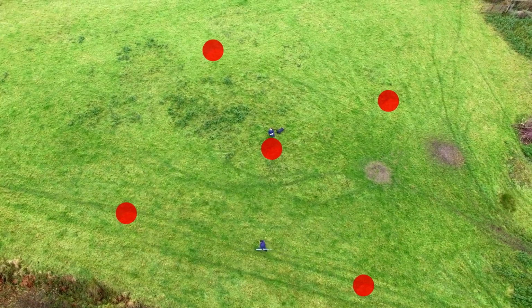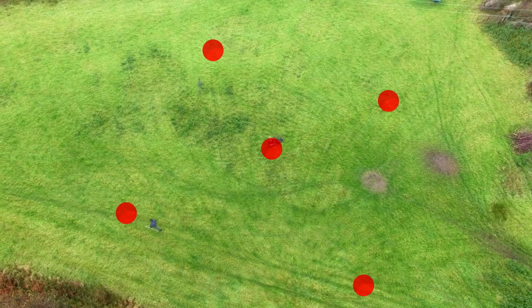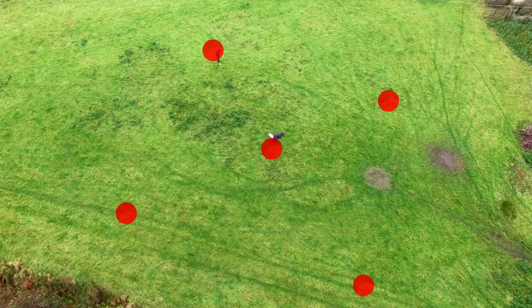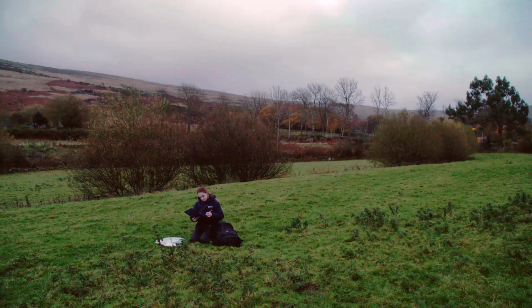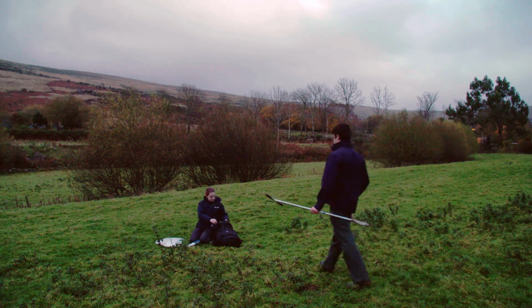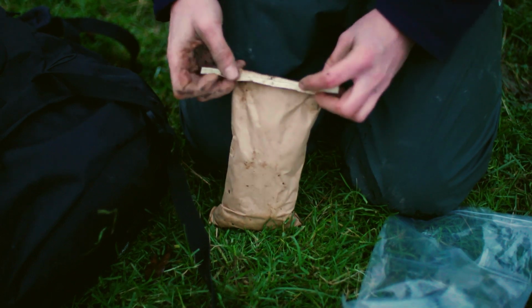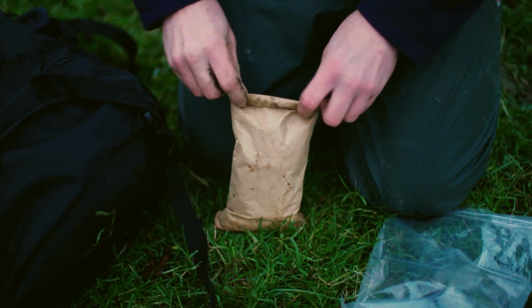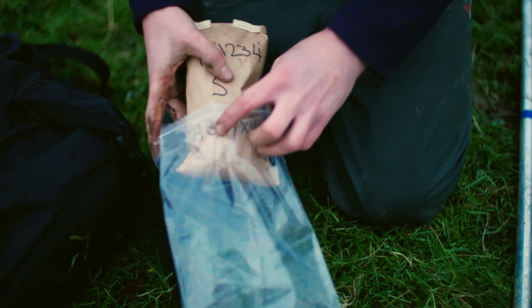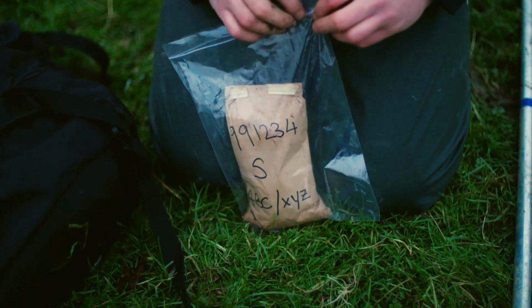After samples have been collected from all 5 auger holes, assess the fullness of the sample bags. If necessary, additional auger holes from applicable depths can be collected from anywhere within the 20 metre by 20 metre square to fill the bag. Note this in your observations. Seal each bag by folding the metal tab and bending the tabs to the front. Always place the sample bag into a poly bag to avoid any sample loss or cross-contamination during transportation.